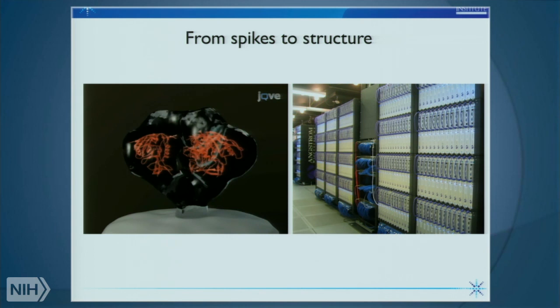And it really came alive because we had at that time already very powerful structural information from the work that Peter Kwong had done, where he had determined the structures of the individual GP120 protomers, both in combination with molecules like CD4, but also with many other antibodies. And this was very powerful information for us to position these molecules into the density map.